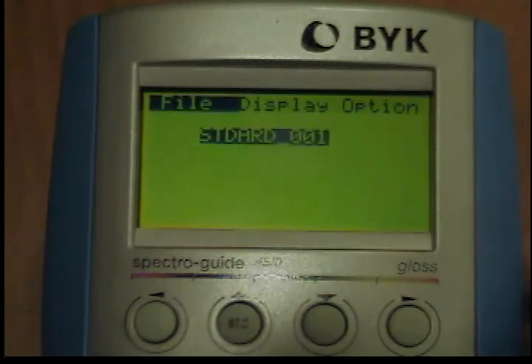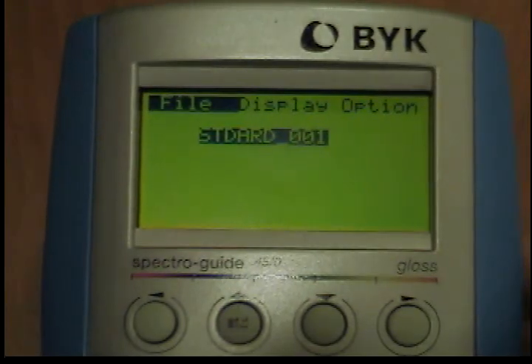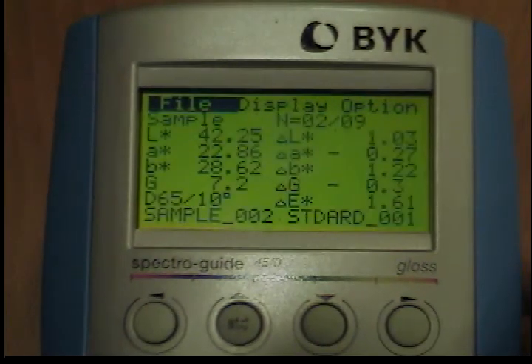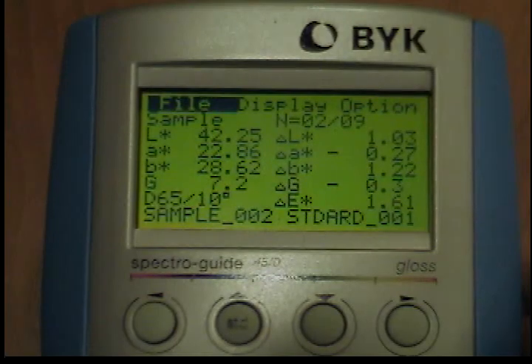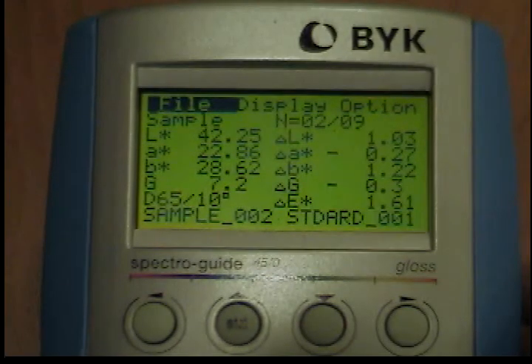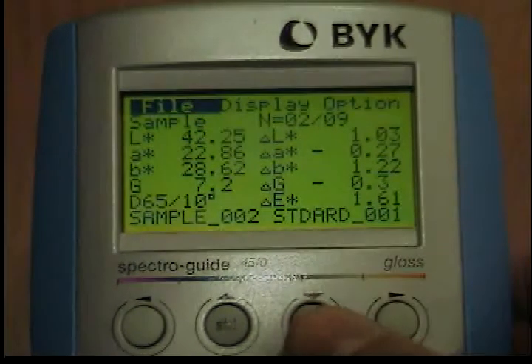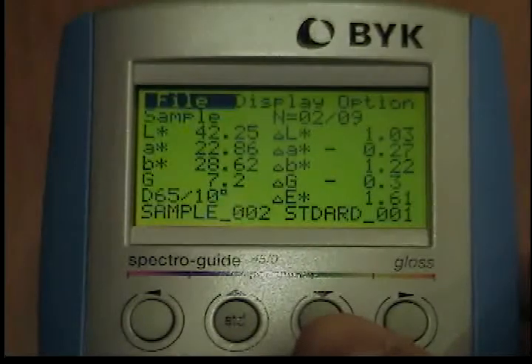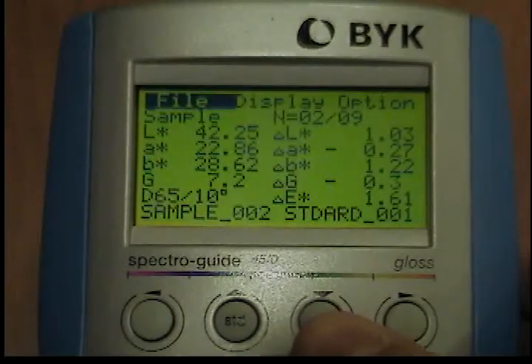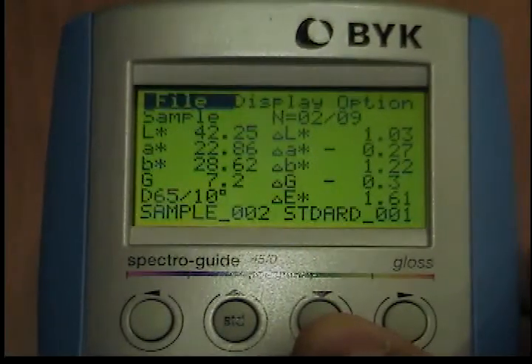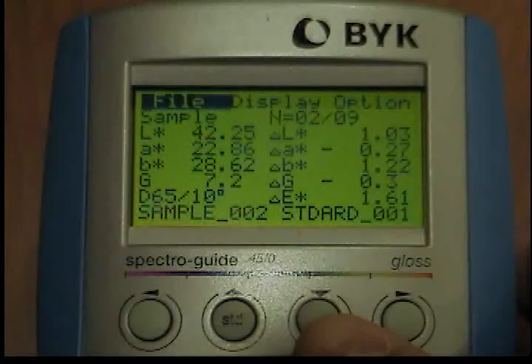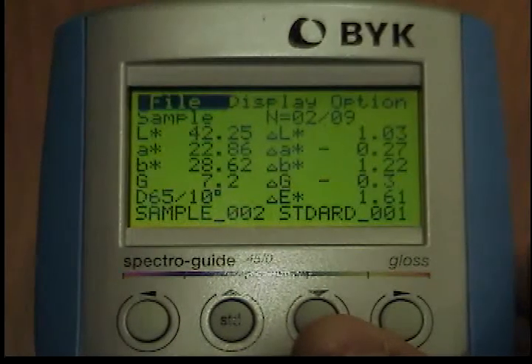All stored standards will appear. Use the Up and Down buttons to select the desired standard and press the Operate button. The cursor will always be positioned on the standard which was selected most recently. After the standard has been selected, the instrument returns to the previous measuring mode. The standard is displayed below the illumination.